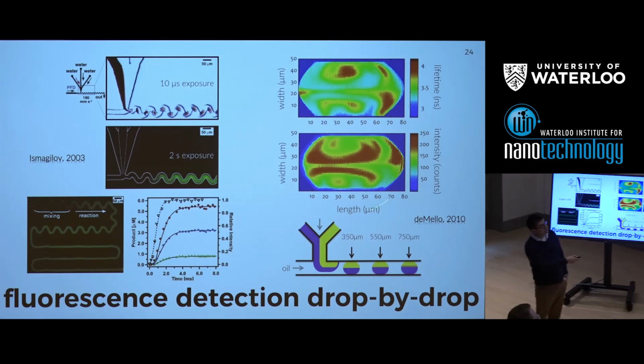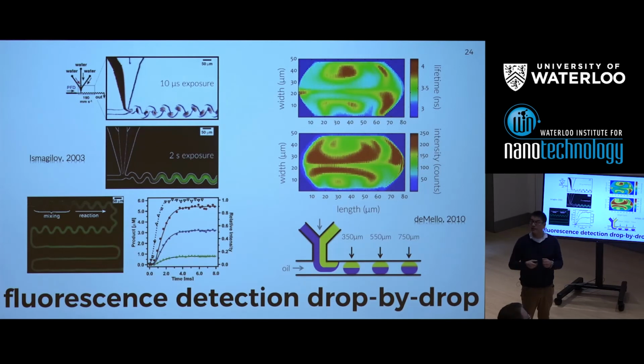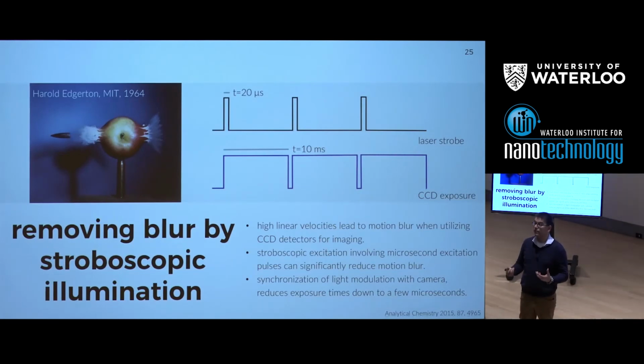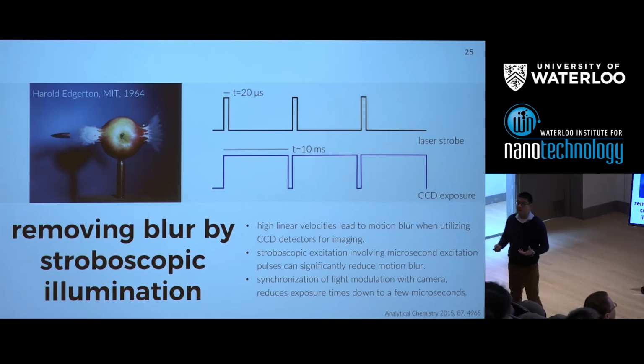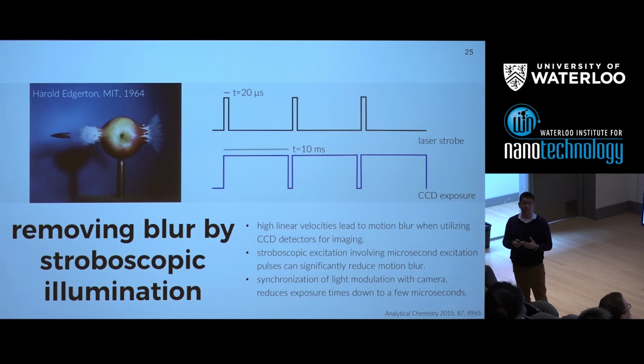And then again, in the same sense, for us to extract these lifetime mixing patterns here, we have to work on the basis that I can make many, many identical droplets, and I can build that information up to generate our mixing patterns. So we began to think about, is there a very easy and direct way in which we can improve the situation? And as so many things go, we realized that technology existed for a very long time, which would enable us to do much more efficient extraction of information from droplets.